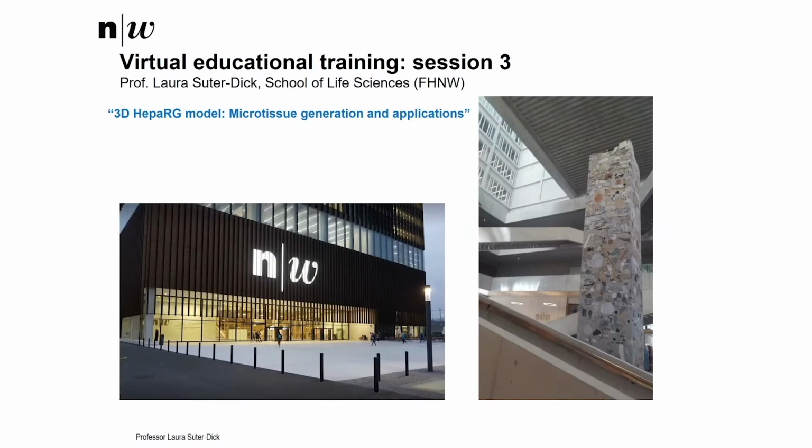So this virtual educational training, as I said, I'm Laura Suter-Dick. I will be moderating this, and it consists roughly of three parts. I will introduce the topic of the three-dimensional liver models with a PowerPoint presentation. I expect to take about 20 minutes to do this, so that you know what we're talking about and what you're going to see. The second part is a video recording of all the practical steps in the lab.